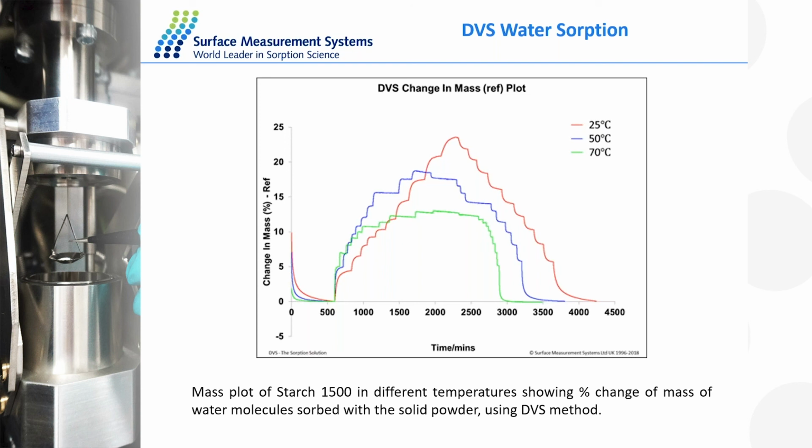Or could I say you could do an ISO-RH experiment? So then just pick 50% RH and do 25, 30, 40C and get a fair idea of the expected change. Exactly. Yeah, that's another way of looking at it. That's absolutely right. Okay, that's good to know.